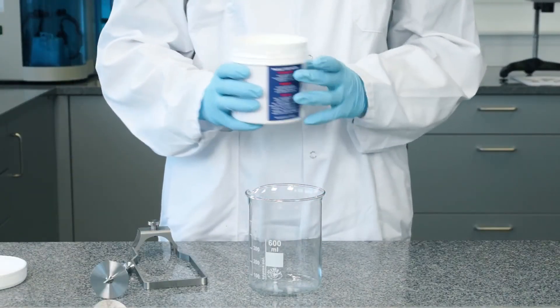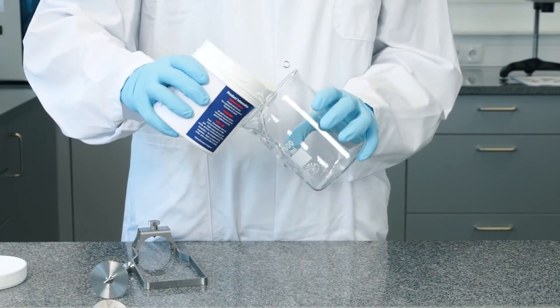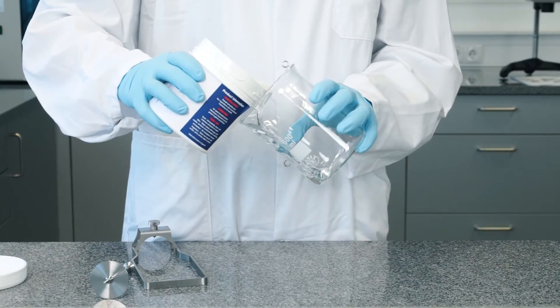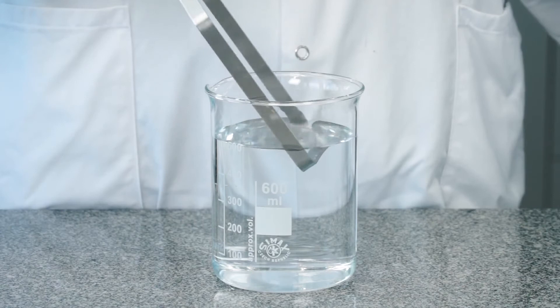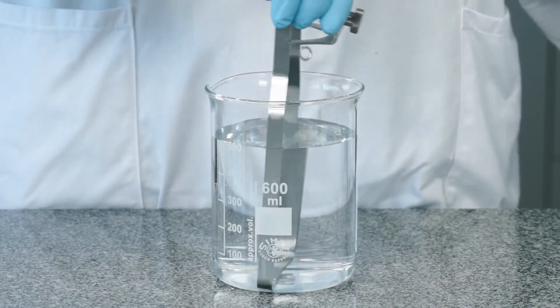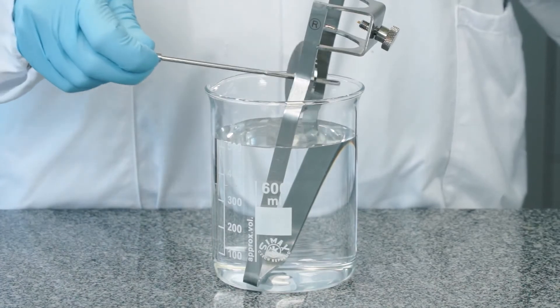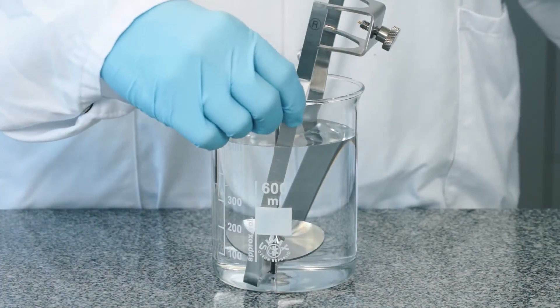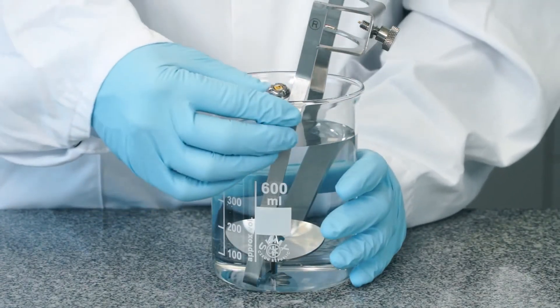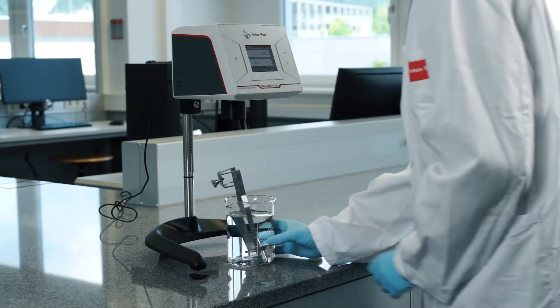To ensure precise measurement, fill 500 milliliters of your sample bubble-free in a 600 milliliter beaker. Insert the spindle guard followed by the spindle. Then position your beaker under the instrument and adjust the height with the knob on the side.